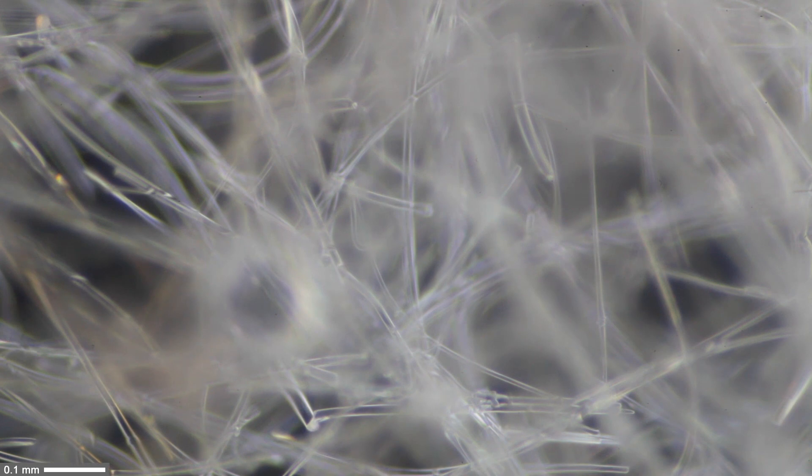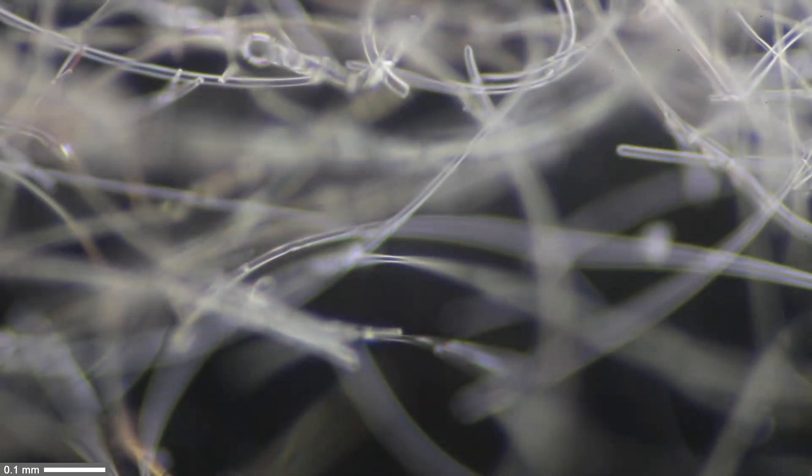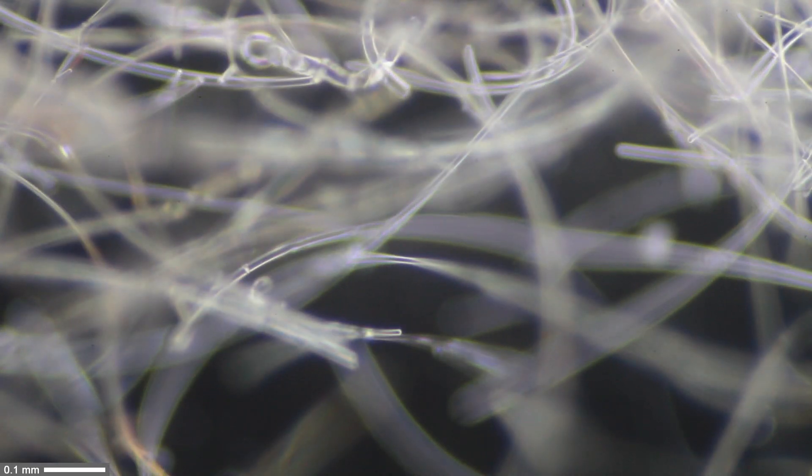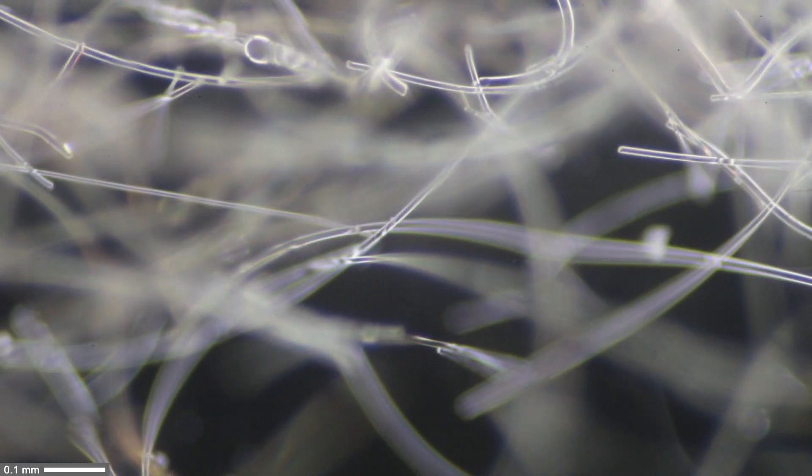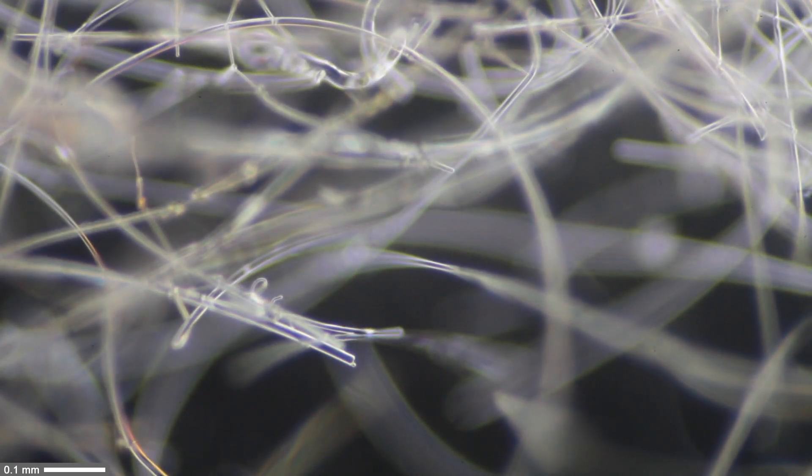Using the 10x magnifying objective, everything is not only much larger but also the depth of field is lower, so it's kind of blurry. This is why I'm always refocusing a little bit.